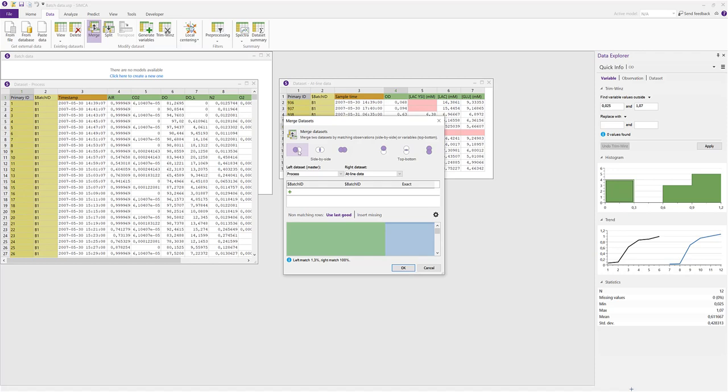The green and blue colors in the merge visualization represent the two data sets. The left green is the master data set, the process data, which is complete. The blue represents the slave data set, in our case the at-line data.